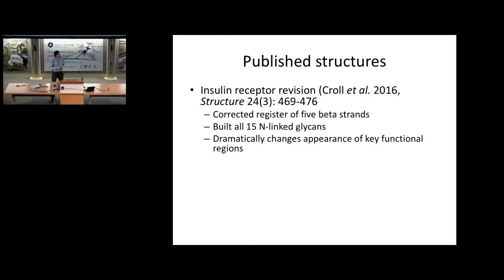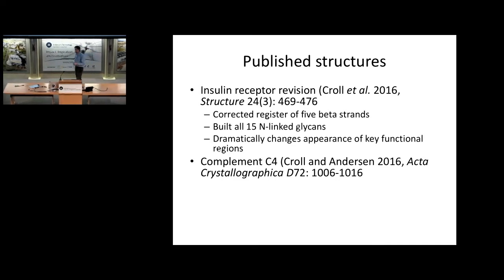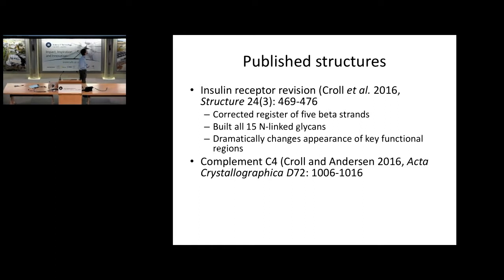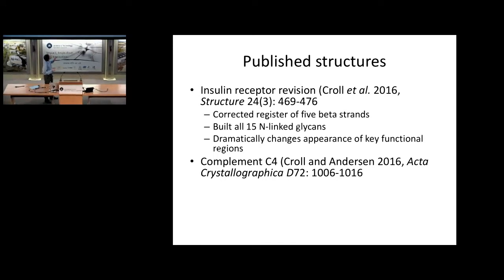Also built the N-link glycans, and this again was in the old version of this, which did have support for much larger chemical space, which will come back over time. The next one was with Gregers Andersen at Aarhus University in Denmark, was these complement C4 structures. Again, these were ones I came across simply by browsing through the protein data bank and playing with structures. I actually like to do it sometimes just to relax, to be honest.